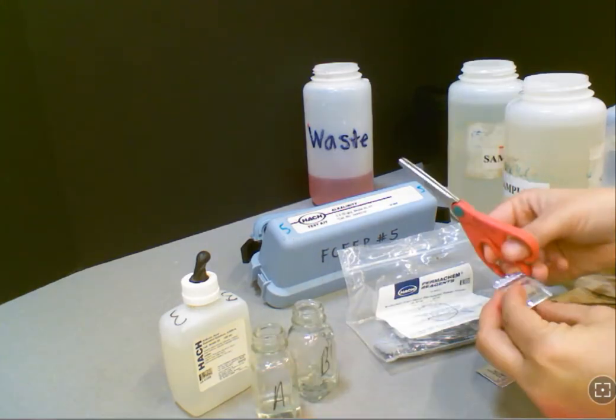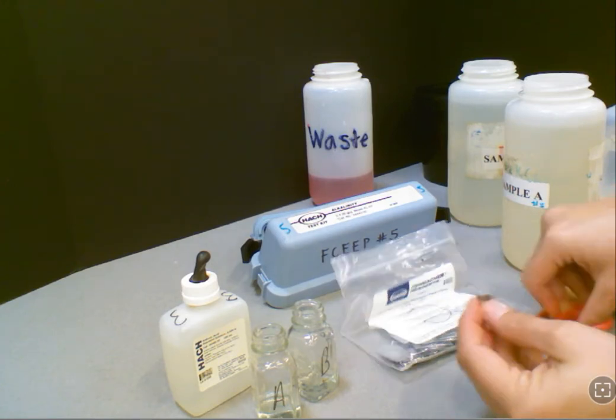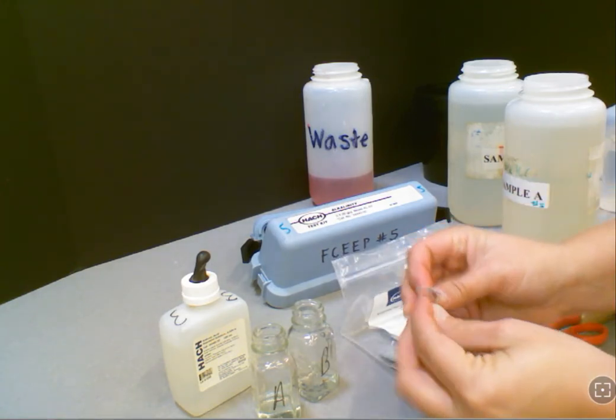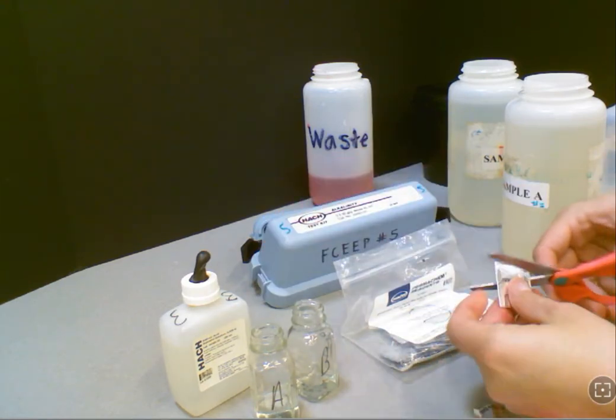So the first chemical you're going to add is phenolphthalein, and if your instructor has marked it, this will be number one. Go ahead and cut open your pillow, and then you're going to pour that into sample A, and then you're going to get another packet and pour it into sample B.